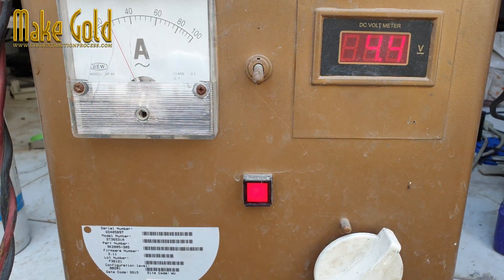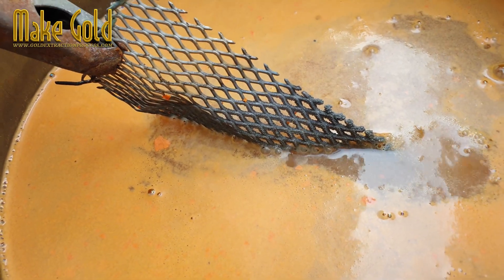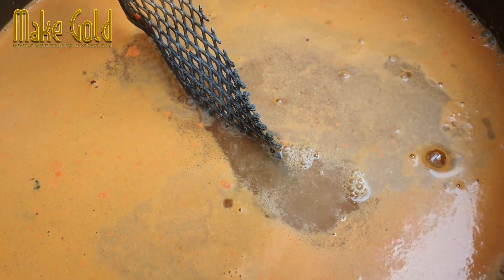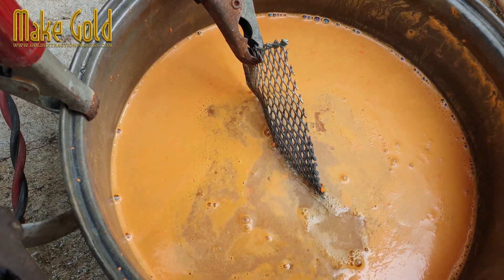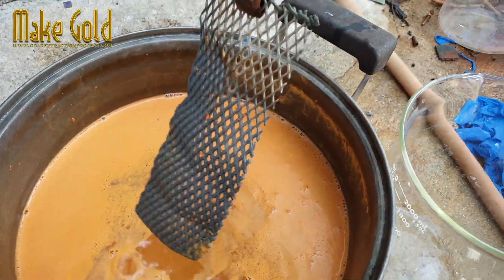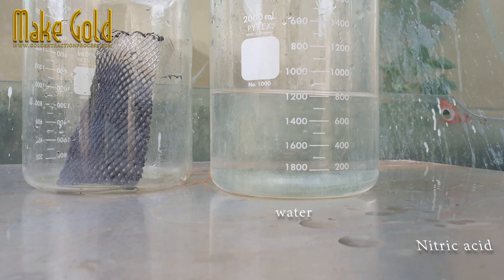You should make the chemical basic first — the pH should be at or near 7. We will use electricity to pull the metals in the water to stick to the plate. When we have the metal that is stuck to the plate, use nitric acid to dissolve the metal. There will be a small amount of gold and metals that nitric acid cannot dissolve.